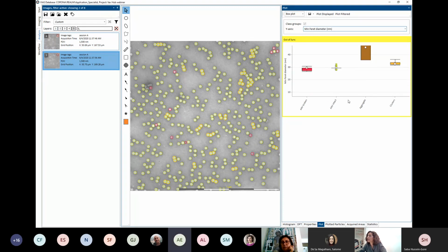Ellie, was that the original comparing it to the DLS? The very original one, the very first one you showed. Right, in the presentation. But I mean, you had done the actual measurements, but the distribution wasn't like this. It was just a genuine graph. Yeah, the one with the DLS overlay. Yes. I mean, this is the thing, right?